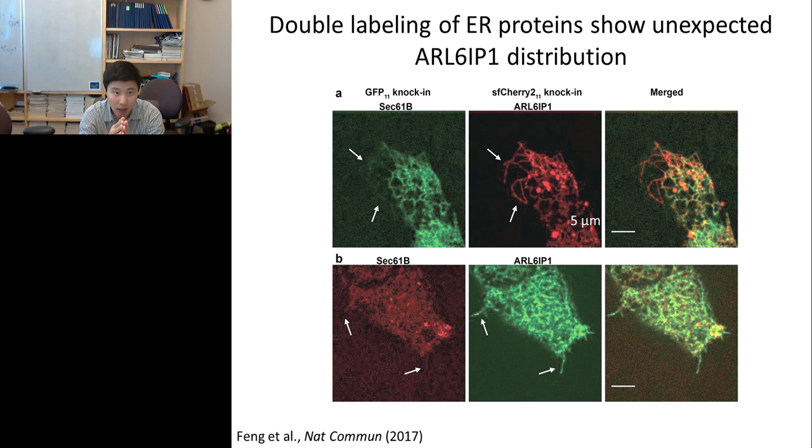In any case, this is a very nice illustration that once we have the capability of tagging endogenous proteins, if we look at those endogenous proteins, we may have some nice surprising discoveries that people have not seen before because of the limitations of labeling.